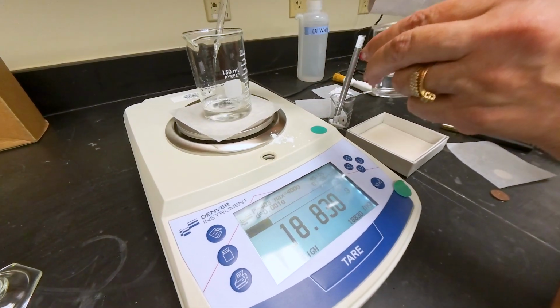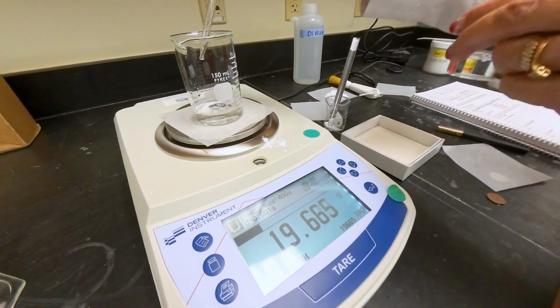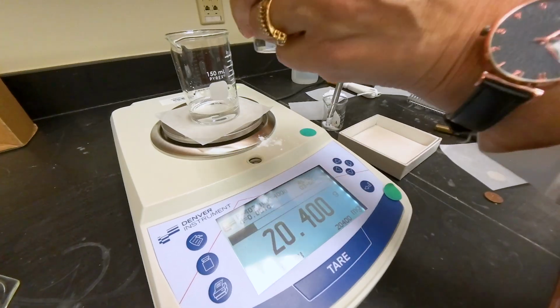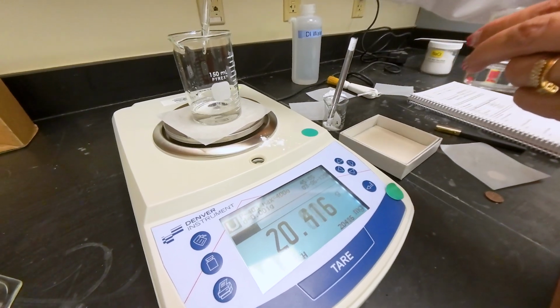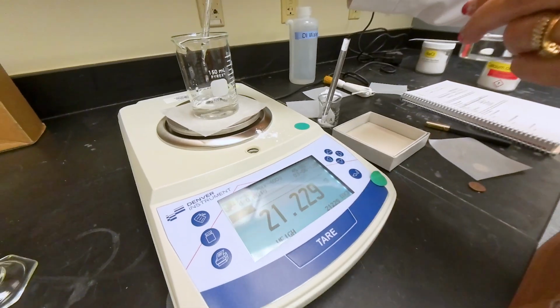Basically, you're adding 1 drop at a time. This type of measurement is going to be more time consuming because you want the exact number.